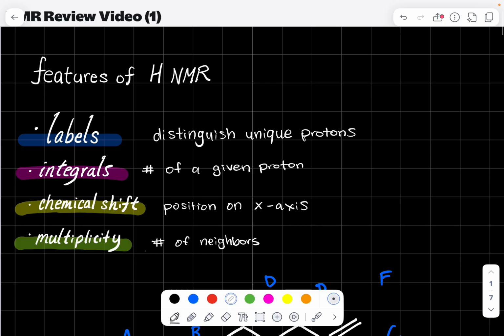I thought it might be helpful to make a quick review video for NMR, as you'll be seeing it in every lab for this course. For HNMR, we look at four main aspects. There's labels, integrals, chemical shift, and multiplicity.